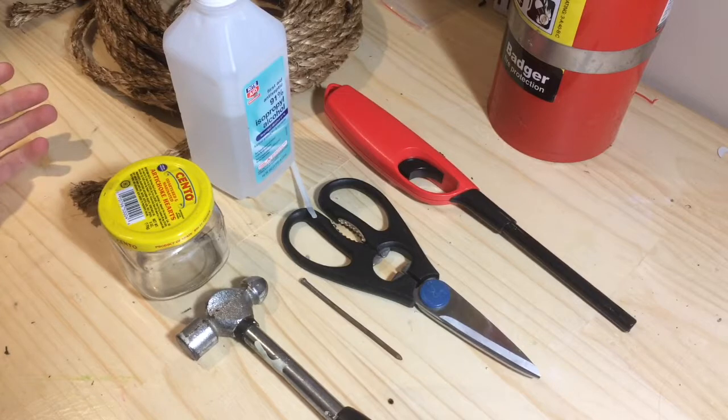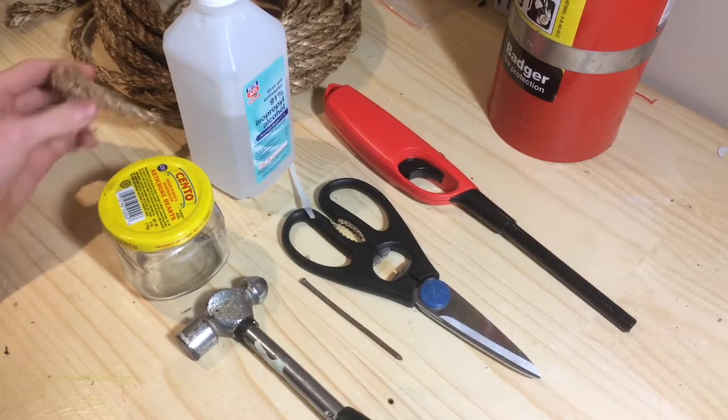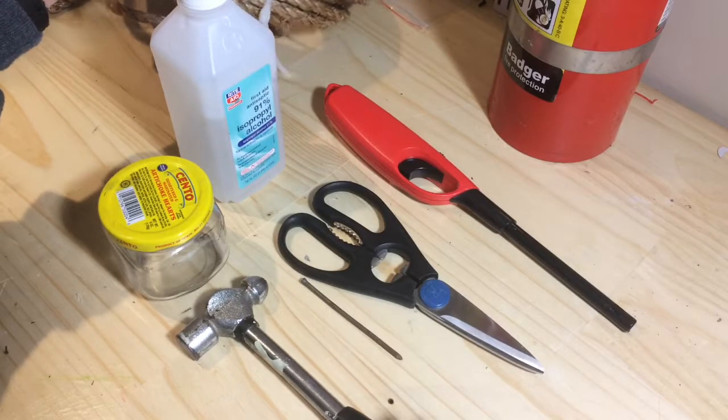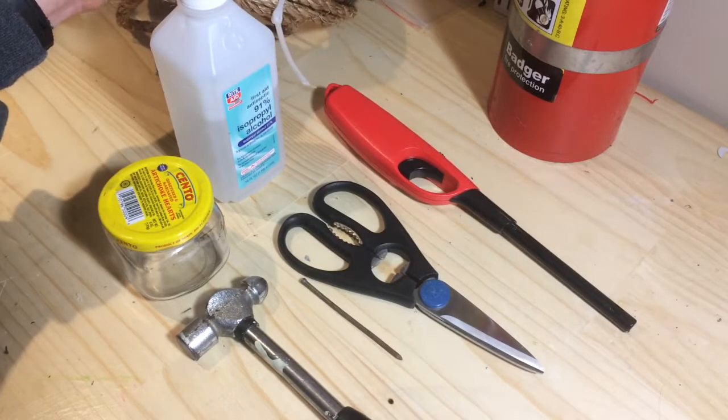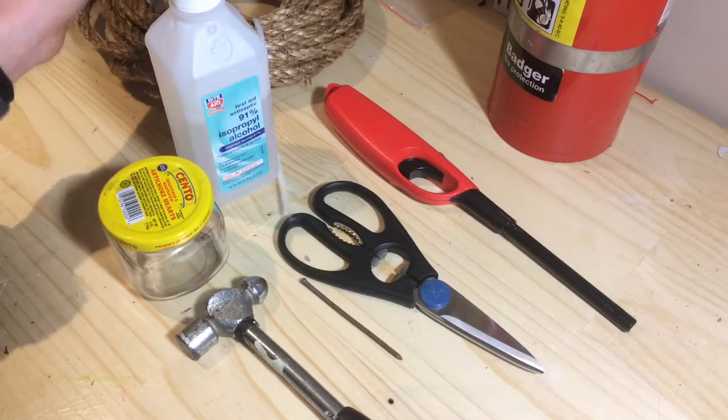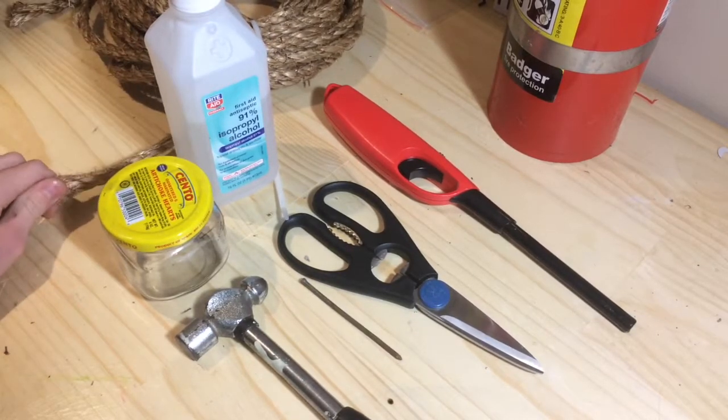You don't want rope that melts at the end. What you want is stuff like this — not twine, but this kind of rope. Not brand new rope; try to find old rope around your house, like clothesline rope and similar stuff.